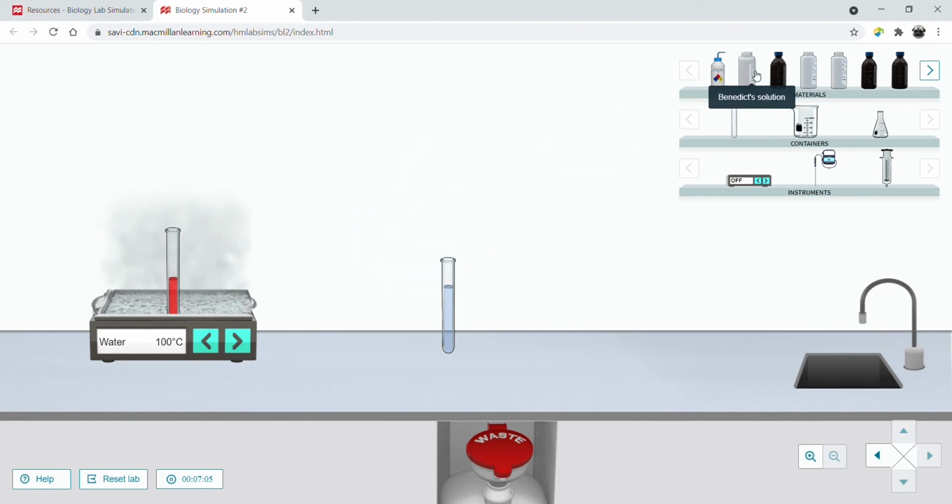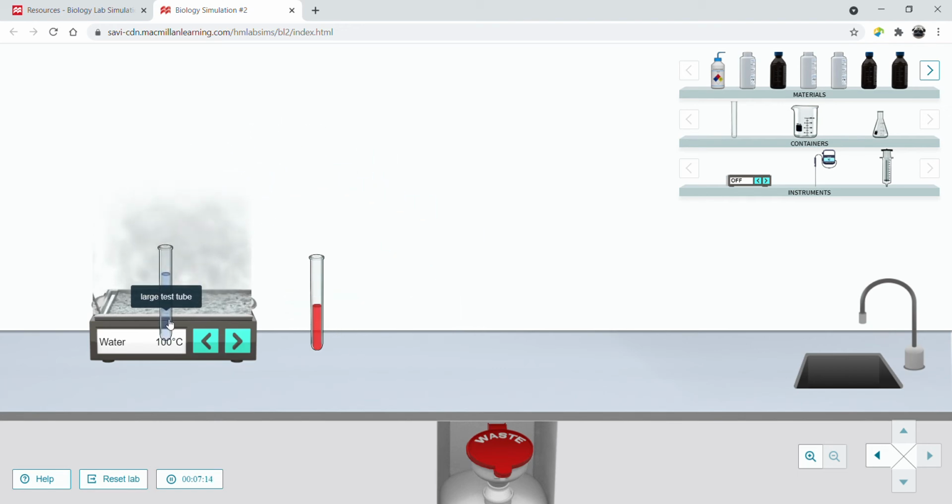Okay, so we look here. We're going to take this out. That turned, oh, no, I'm sorry. Record this in your table as far as the color of solution after Benedict's is heated. That was the 5% glucose. Now this is our negative control. This is water with Benedict's solution. And you can see that I wasn't paying attention. So we're going to take that out.